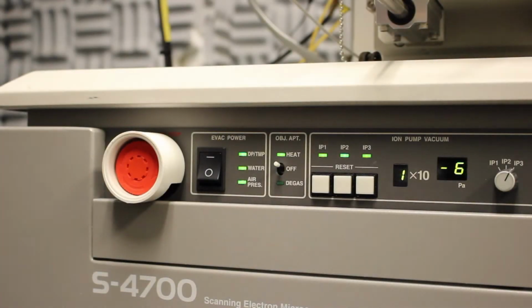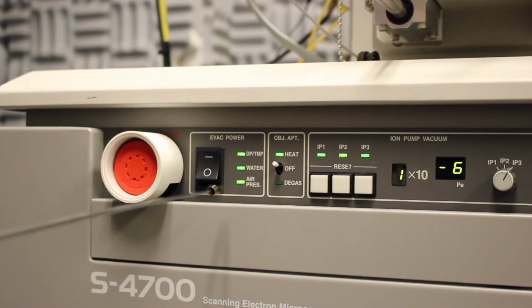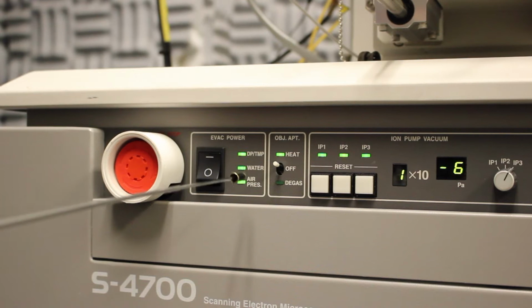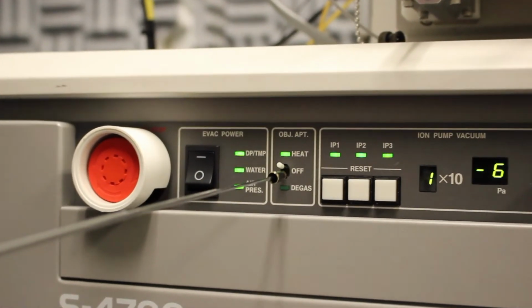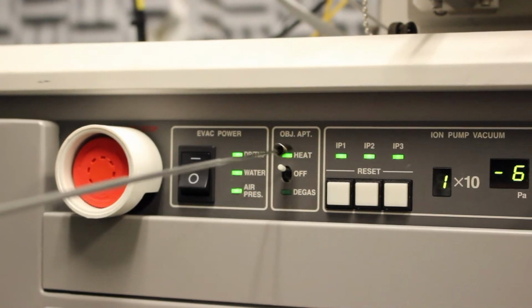Checking the vacuum defaults. This is the emergency off button. This is the evacuation power status. The turbomolecular pump, water and air pressure should all be green. The objective aperture should be in heat mode with a green light.